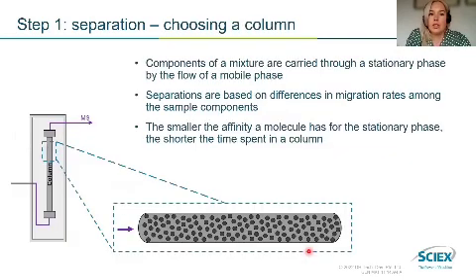So now we've looked at our HPLC system and gave a brief overview how it works. One important step in separation is choosing our column.